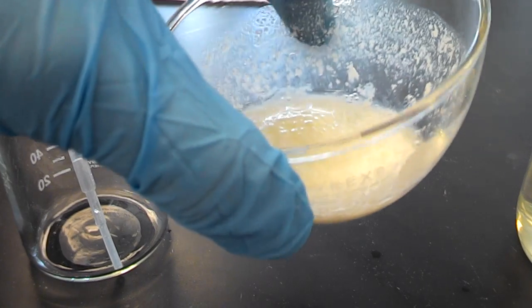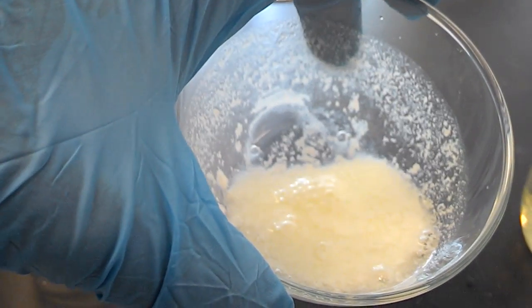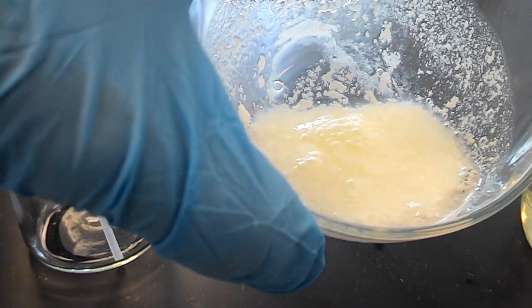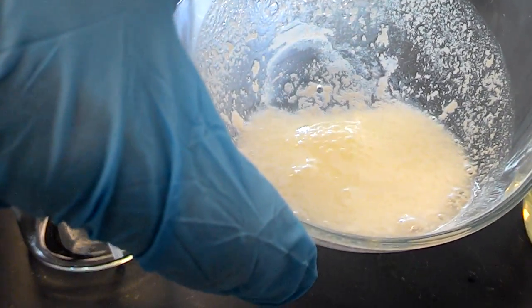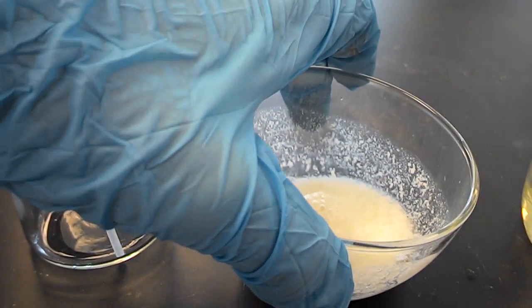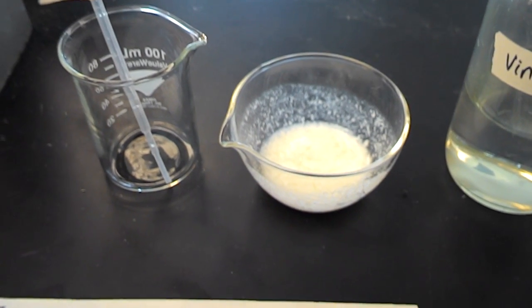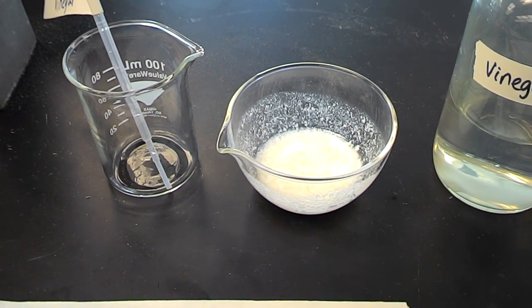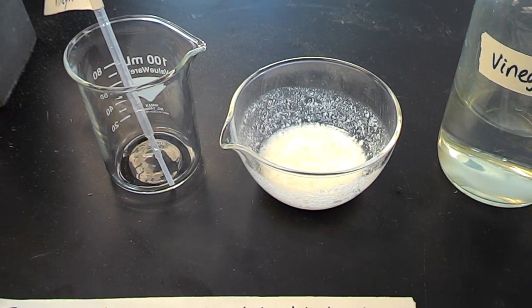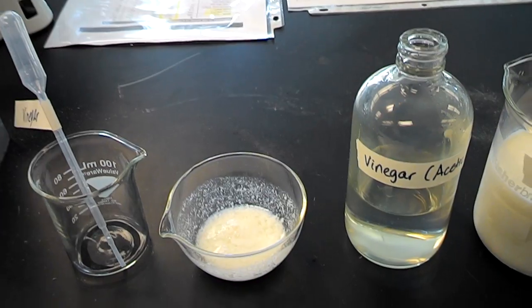As you can tell, you took 2 liquids and you made some solids. And you can also see some solids kind of floating around in the mixture. Now determine if it's a physical or chemical change, and then record it in your lab notebook. Be sure to clean afterwards and wash and dry all glassware. And put the lids back on your chemicals.